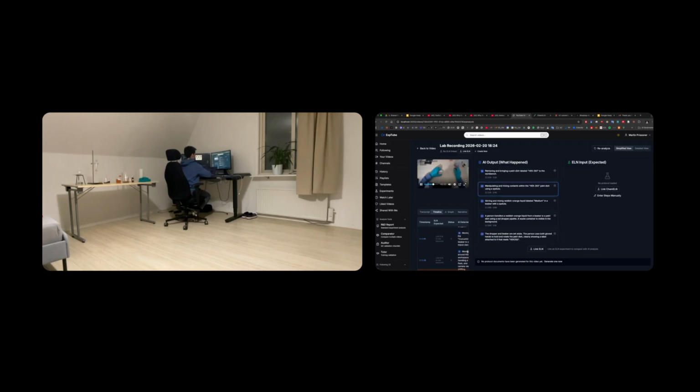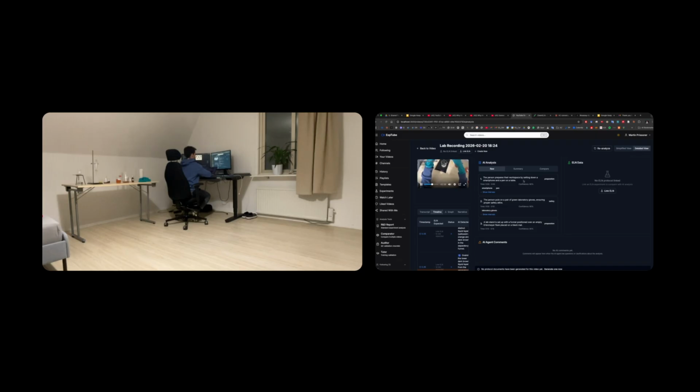You can see when we were operating with the HEK cells or adding some liquid. You can also go to the more detailed analysis where you have full transparency on what step was happening along the way. You can always jump to the specific time point.